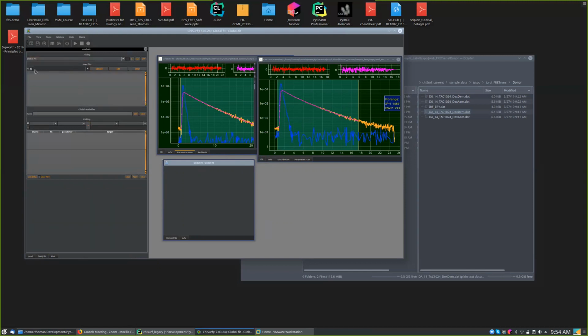Here to the left, next to the fit, if you click on update, you should be presented all the fits that are in the program so far. If you leave this checkbox in and just click on add, all fits will be added. So all the data sets of all the fits will be added to the global fit. You can also clear again. If you only want to add an individual one, you can uncheck this box, select an individual one, and then add it individually.